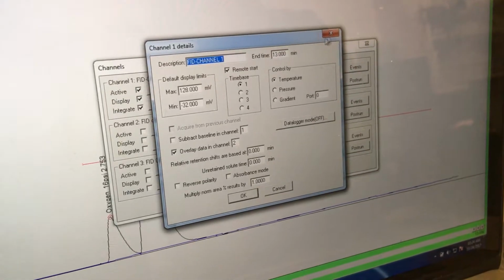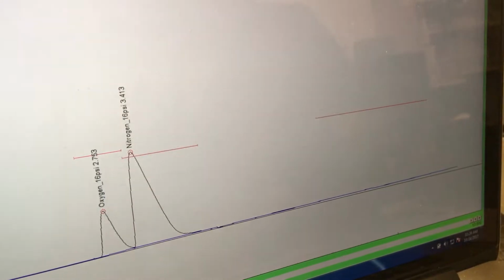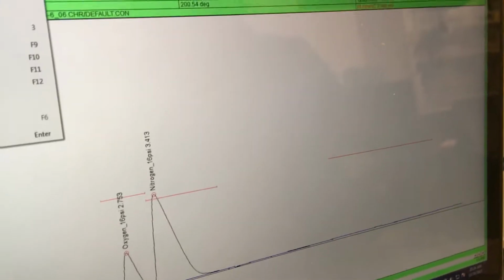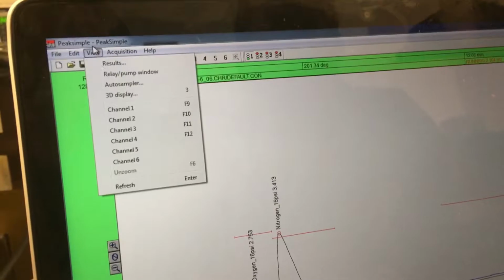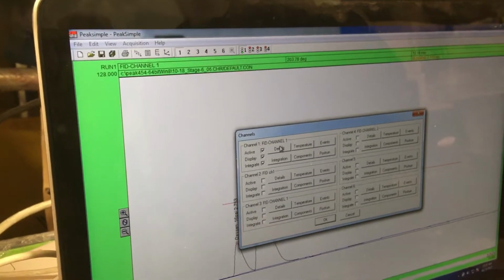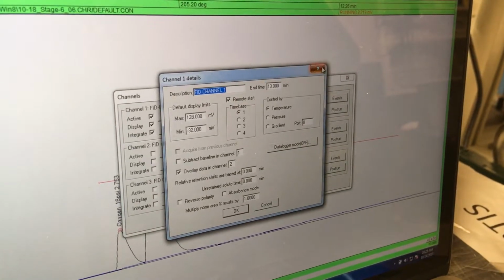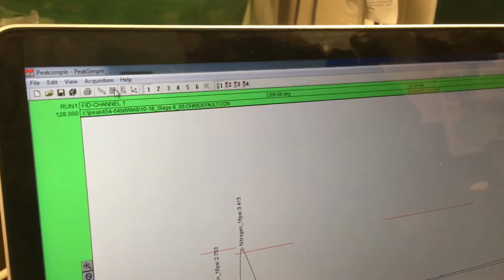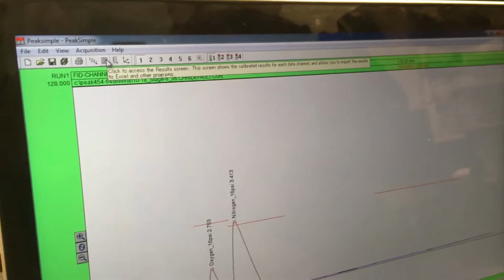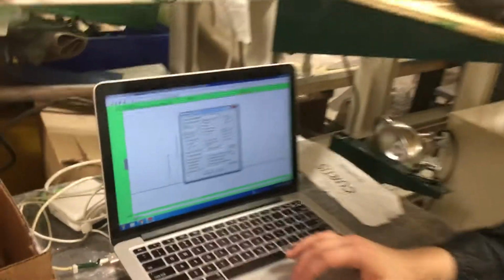No, is it? Maybe it is not in details. Channel. Nope, that's not right. Same thing. Maybe. Is that in your startup document? It's in the startup document. Okay. So we can maybe truncate this, sorry. I know where it is though. Overall. Oh, it's in overall. Is it still recording? Okay, yeah.